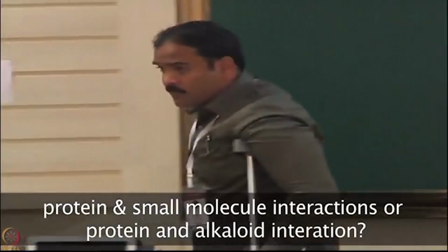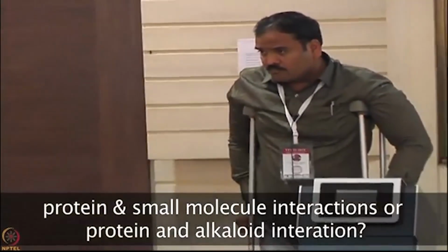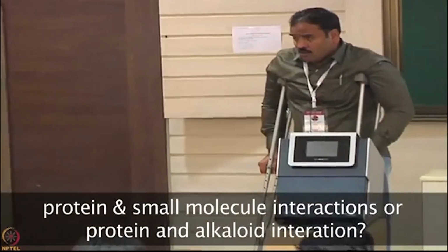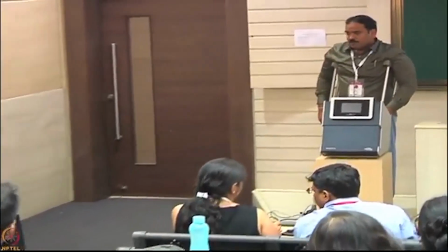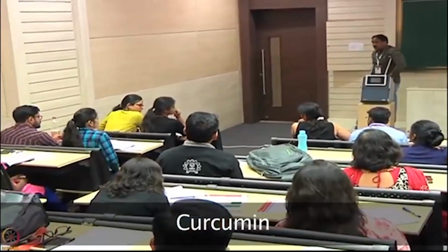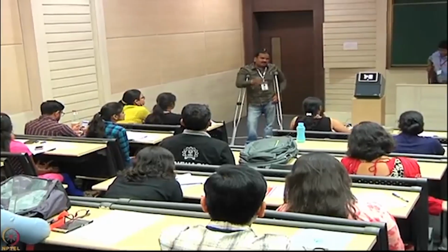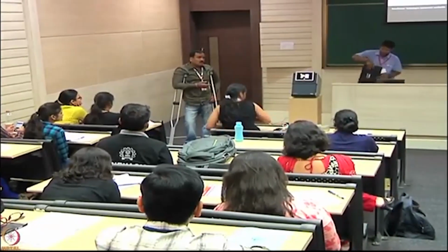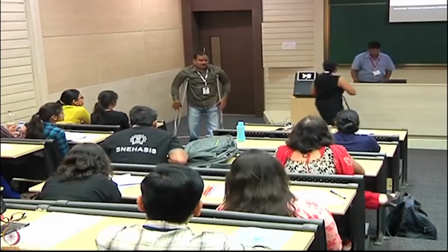This protein and small molecule interaction, then protein and this alkaloid. See, that's what I'm saying. In principle, anything is possible. Alkaloid, can you tell me an example? Curcumin. So very recently, as I said, 15 minutes is the measurement time. So maybe people can come to the front and just wander, or you can sit there and see however you wish.